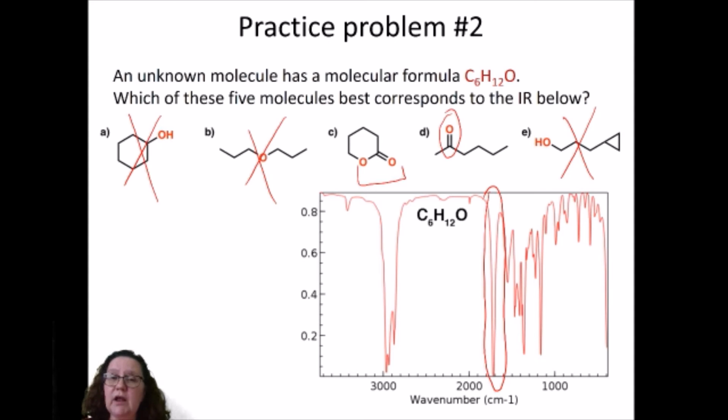So there are some differences in position that can be observed between a carbonyl group that belongs to an ester or a ketone, and I might be able to look into those if needed. But there's an easier way of identifying which compound it is.